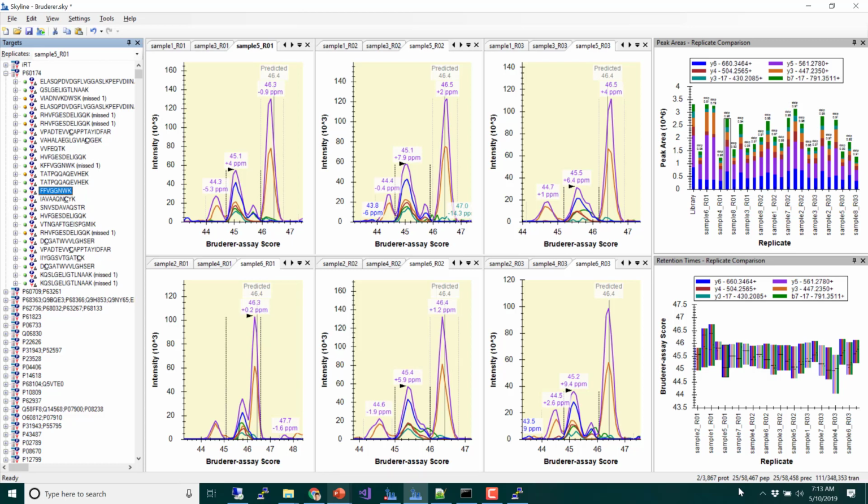That's where those slides I've been showing you come in: wow, look at the statistical difference among these peptides, with a p-value of 10 to the -7. And then we go look at it and maybe there's some interference. So it's easy once you decide you're interested in, say, FFVG as a biomarker, to go look at it and see there was all this interference, and retry that.